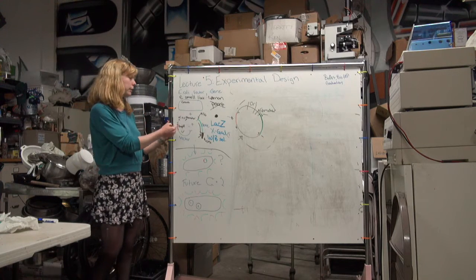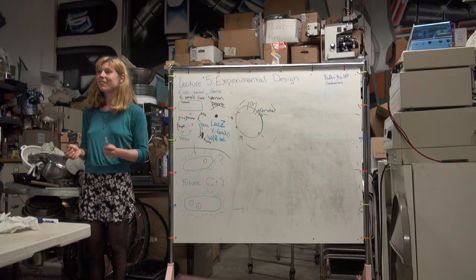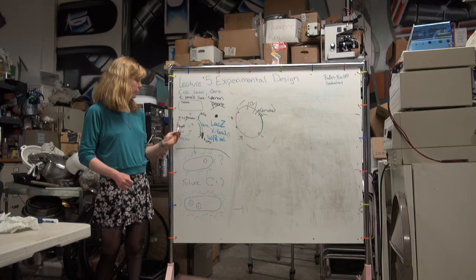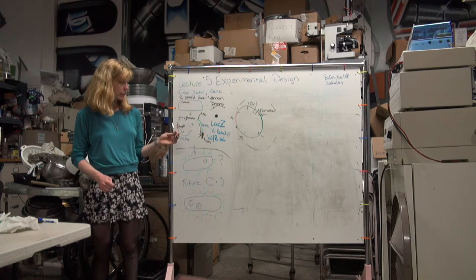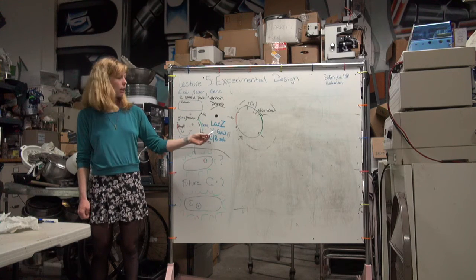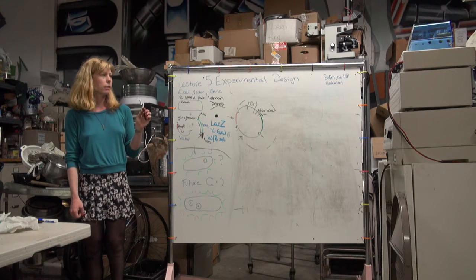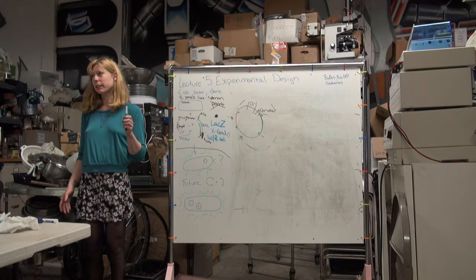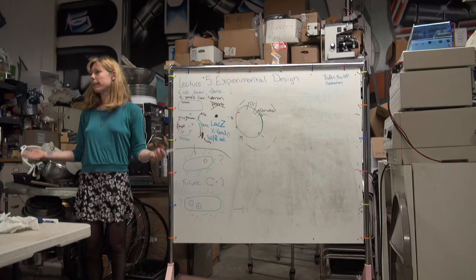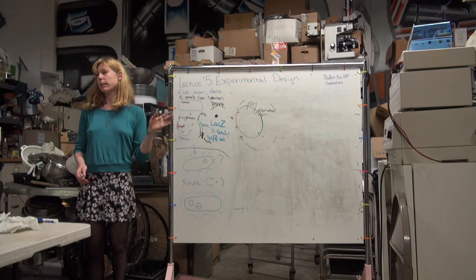Now, once I remove ampicillin resistance, it's going to be really hard to choose which one. If we do want to remove ampicillin resistance, we're going to have to use some sort of differential selection. But part of the problem with that is it's a lot easier when a good part of the population dies when they don't have what you want, because otherwise it's finding a needle in a haystack.